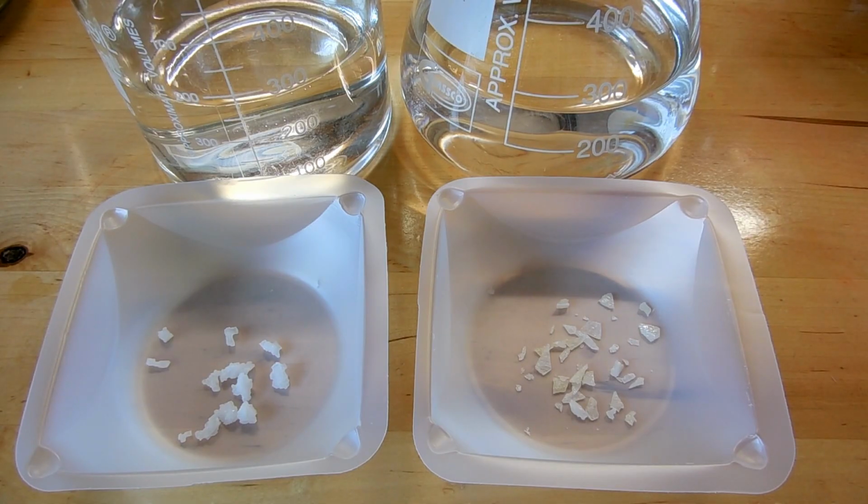Quick word of warning, lead and all of its salts, especially its soluble salts like lead nitrate, are extremely toxic. So you really need to be extremely careful when you're handling these, and really you shouldn't handle them at all unless you're an experienced chemist.